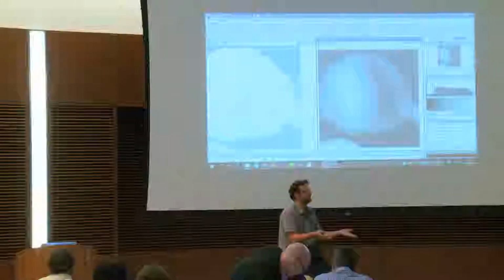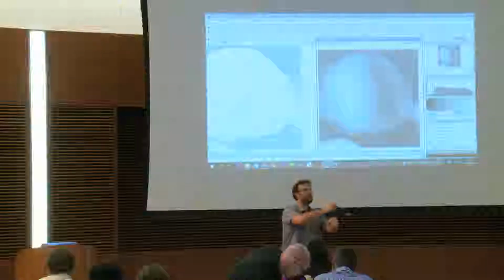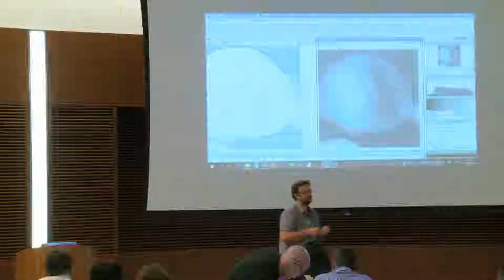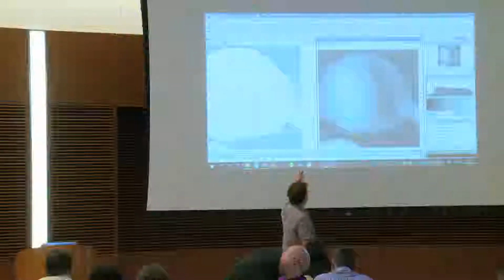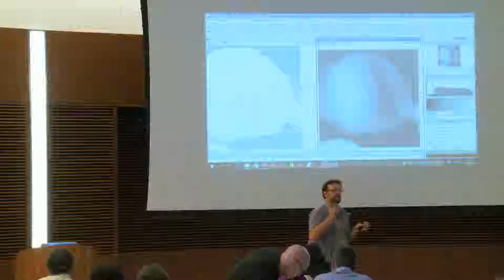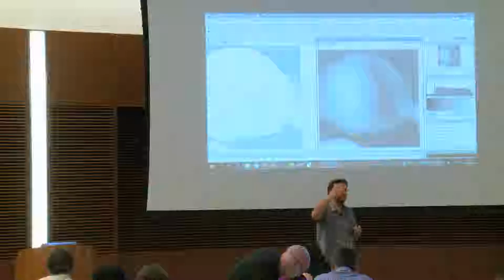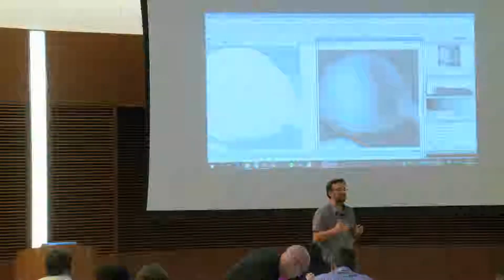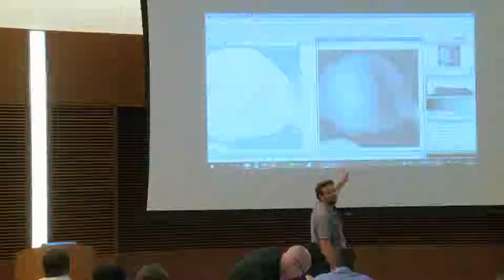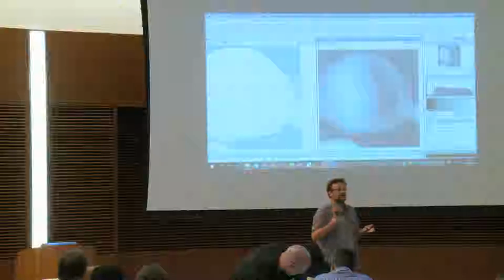in fact, it is the noise of the apparatus, okay? Because when we're going back to the next line, it's not going to take the same Z as a reference. So it's very cool because if I compress this image in JPEG, this will disappear. So I cannot tell you anymore when I see a knob if the knob is over the noise or below the noise. I need to create kind of a model and to measure the noise of the apparatus to know if, when there is a good measurement, it's okay or not.